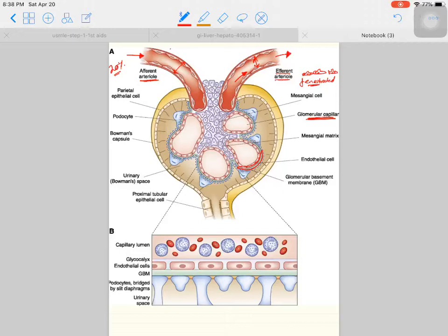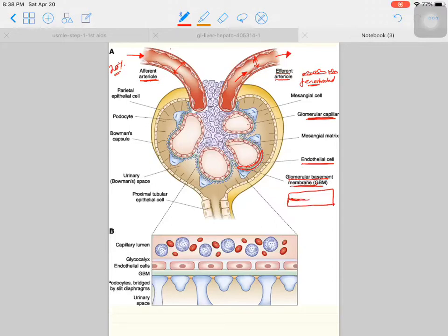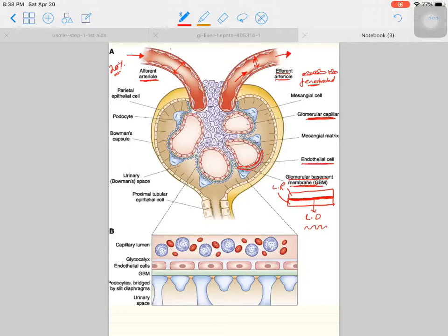After the fenestrated capillaries, there is a basement membrane shown in green color, called the glomerular basement membrane. The endothelial cells are the capillaries, and then comes the basement membrane. The structure of the basement membrane has a thick dense central region and two rare regions on either side. These two regions are called lamina rara interna and lamina rara externa, and the central dense region is called lamina densa.